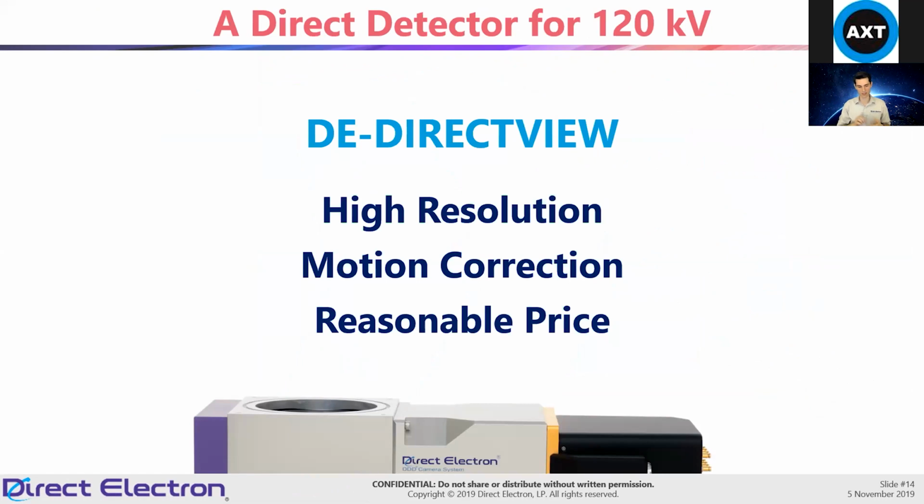You can turn something that's just been used for negative staining into something you can use for regular data collection for your initial models. I'm not in sales or anything like that, but the DirectView is essentially priced in the range of a Gatan OneView, so you can basically get to the OneView price, but you get a direct detector out of it.